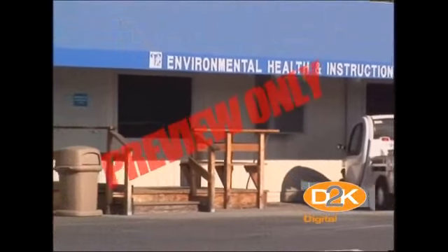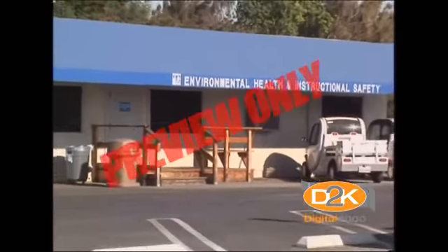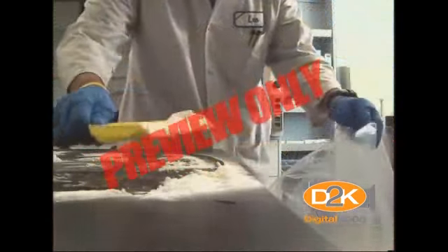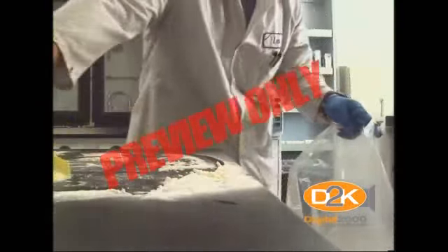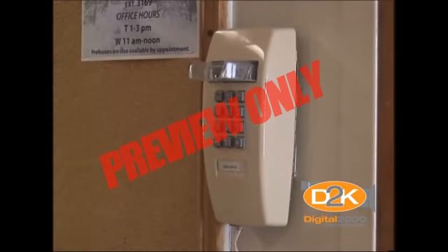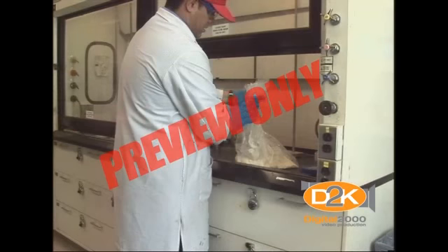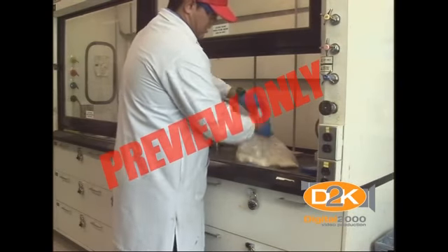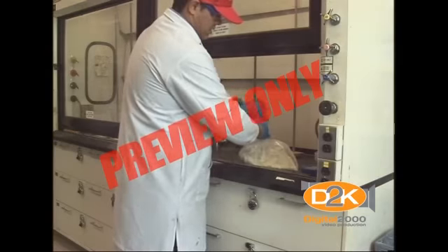Remember, you may clean up a small spill only if you have been properly trained by Environmental Health and Instructional Safety and are familiar with the material and its hazards. For large spills or leaks, make sure to notify University Police by dialing 911. Always use personal protective equipment, including gloves and eye protection, when handling hazardous materials.